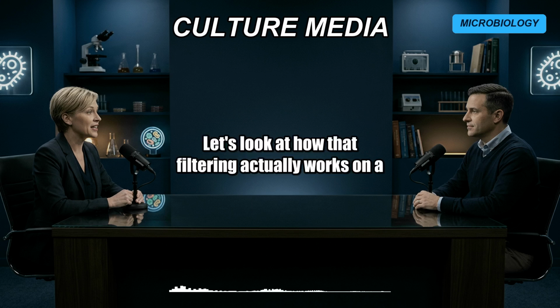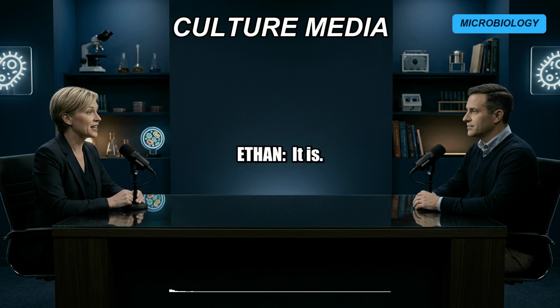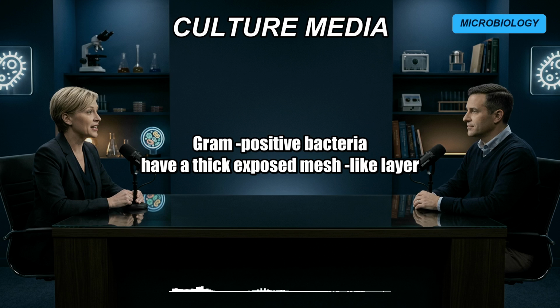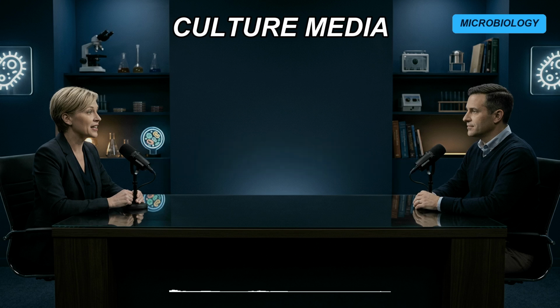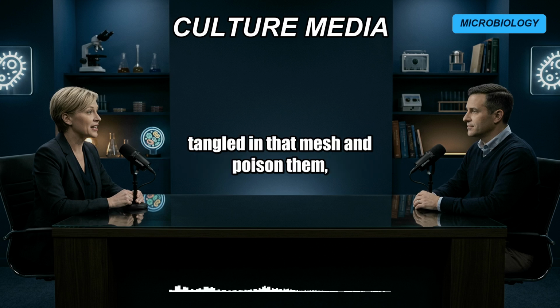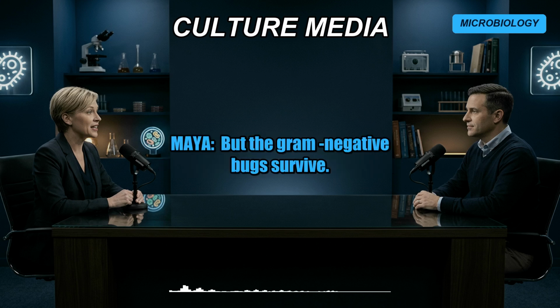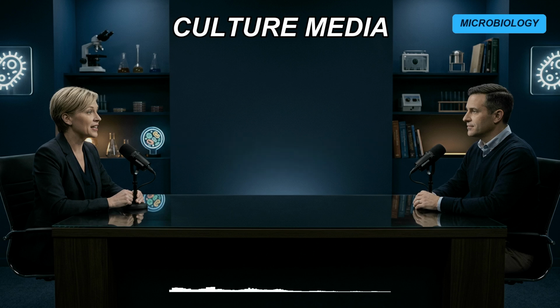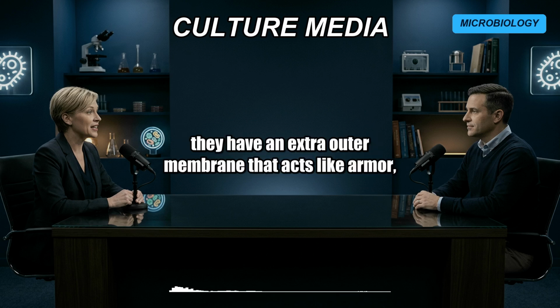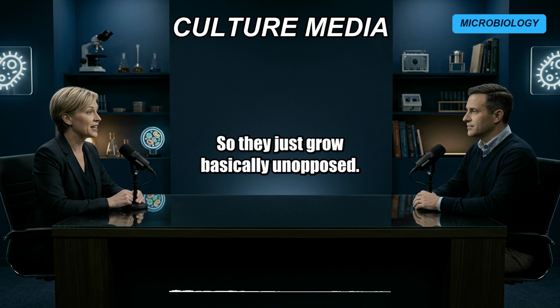Let's look at how that filtering actually works on a structural level, because it's pretty cool. It's basically chemical warfare. It is. Gram-positive bacteria have a thick, exposed mesh-like layer on their outside. The crystal violet dye and the bile salts essentially get tangled in that mesh and poison them, completely disrupting their cell walls. But the gram-negative bugs survive. Exactly. Gram-negative gut organisms like E. coli and Salmonella have an extra outer membrane that acts like armor, keeping the dye out. So they just grow basically unopposed.